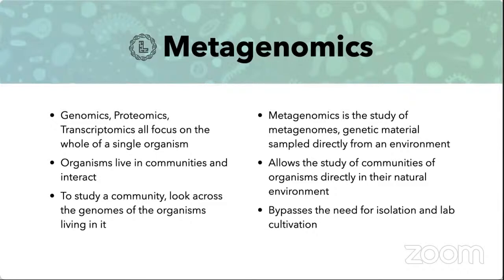And the ability to identify these microbes without a priori knowledge of what the sample contains is opening new doors into research areas like ecology, virology, microbiology, environmental science, and biomedical research. The sequencing-based examination of the metagenome has become an extremely powerful tool for understanding diversity and effects in these research areas, and a very useful tool in generating novel hypotheses that relate the metagenome to them.